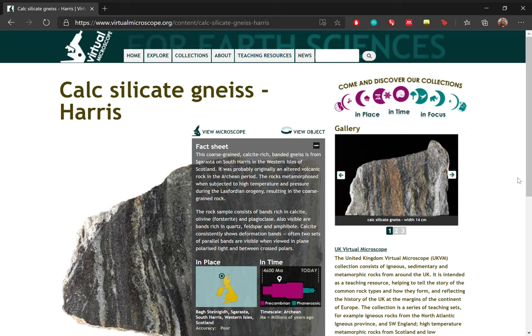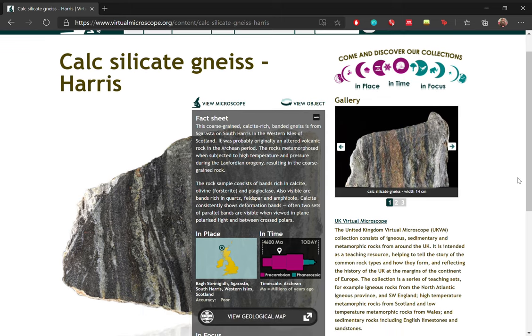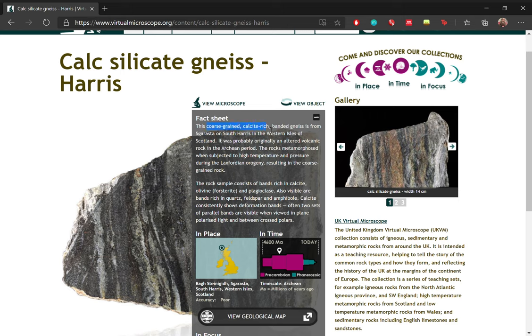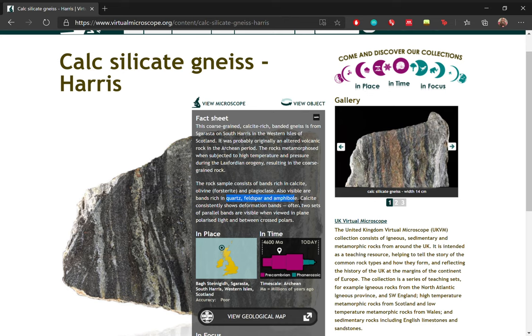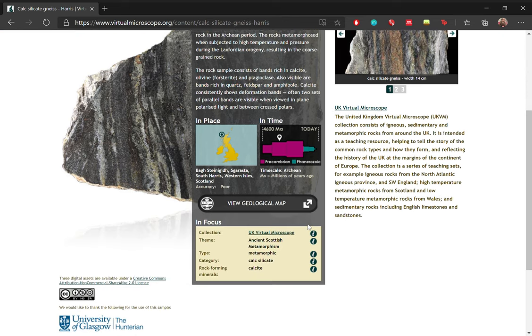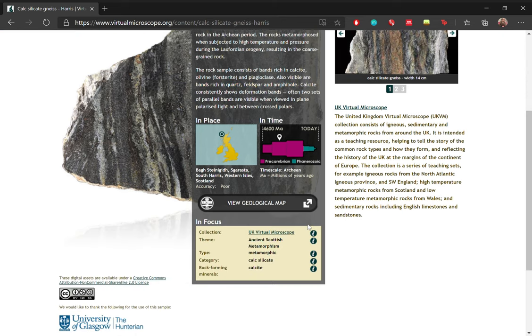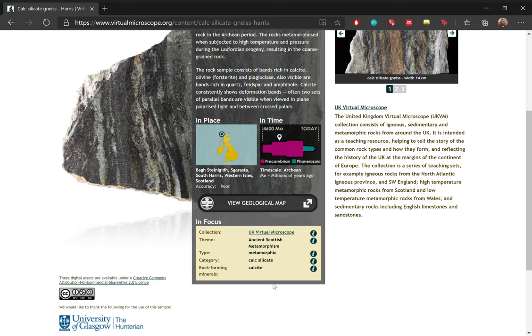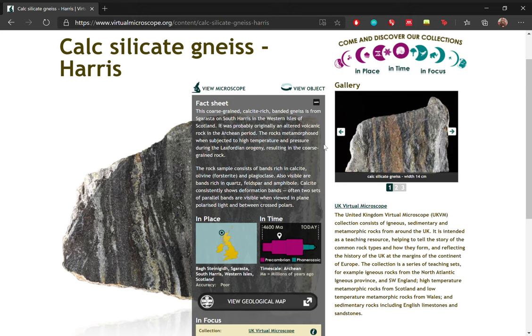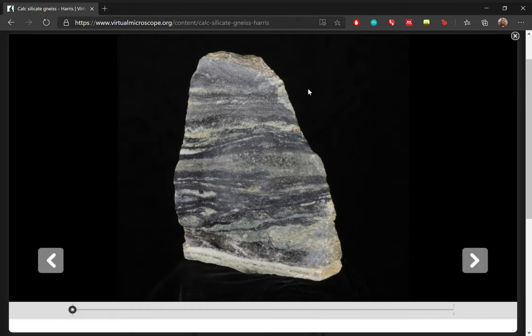So when you click on the name of a rock, you will be taken to a page where it has a fact sheet. So you get to read more about the rock. And so this rock in particular is a coarse-grained calcite rich banded gneiss from South Harris in the Western Isles of Scotland. And it has rich bands rich in calcite, olivine, and plagioclase. And it says here that also visible are bands rich in quartz, feldspar, and amphibole. And with every sample, we have a list on the bottom which tells you what kind of theme it's part of, what type of rock it is, and the rock forming minerals that are of interest. So before we look at the thin section, let's have a look at the rock.